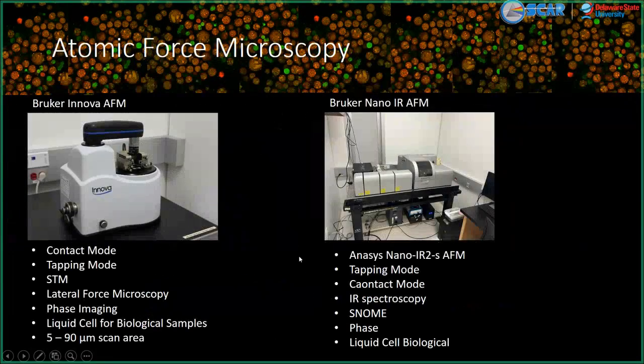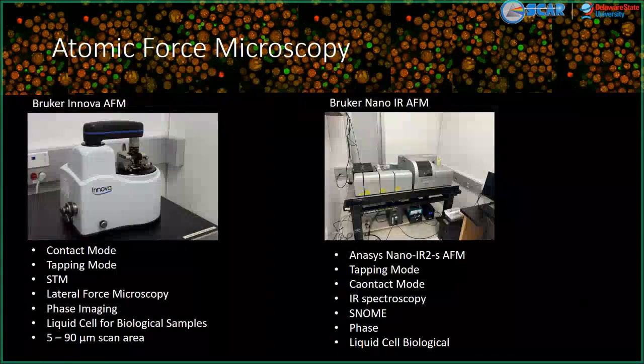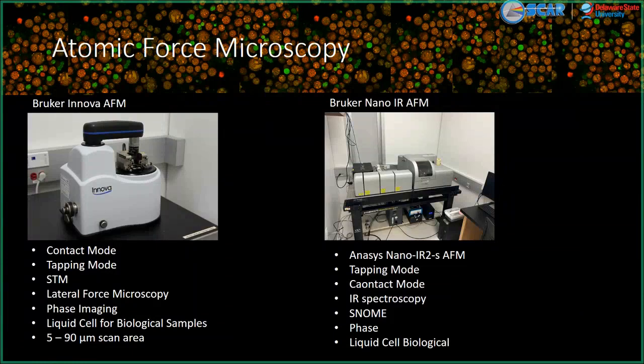We also have atomic force microscopy. So we have a Bruker Innova AFM. That technique, if you're not familiar with AFM, it's a touch technique. It's a technique where a cantilever comes down with a very sharp, what we call a stylus, kind of like a record player, comes down to the surface of a sample. The sample is then moved back and forth in a lateral direction, and then you can collect the topography information. Plus, you can get atomic force information, pulling, pushing, indentation, how hard a sample is.